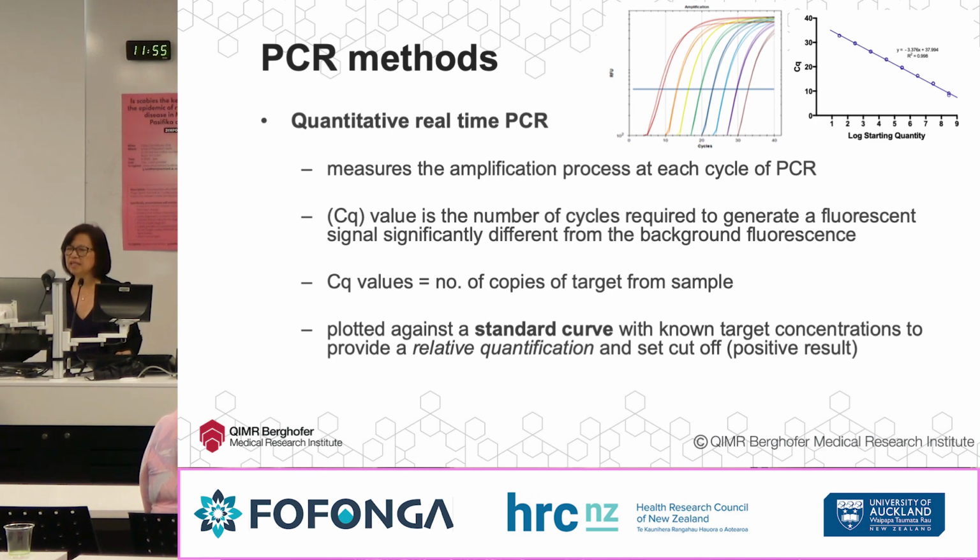And this is your cycle threshold, which means that these are negative background fluorescence, and this is where your positive amplification starts. So this is like the threshold, this line here, and this threshold will tell you that this is the signal now of a positive reaction above the background. And this cycle quantitation value also is synonymous to the number of copies, or how many copies of your scabies mite molecule is in your sample. So this gives you also the number of copies.